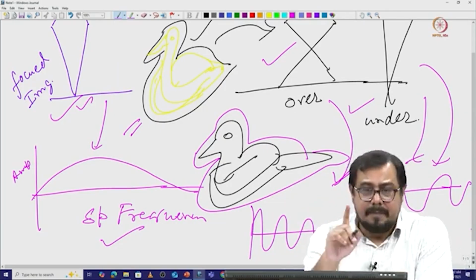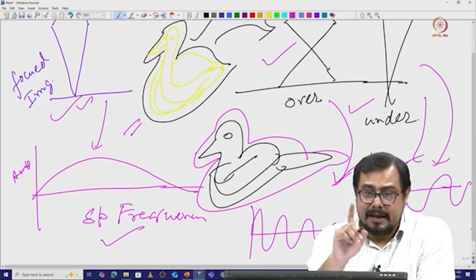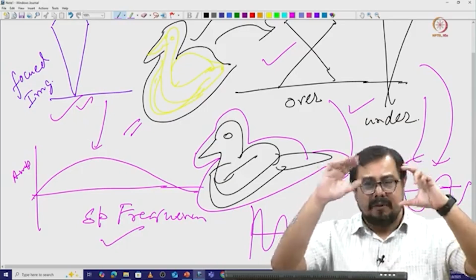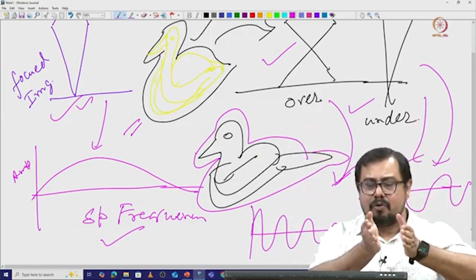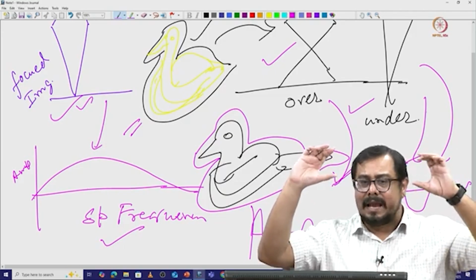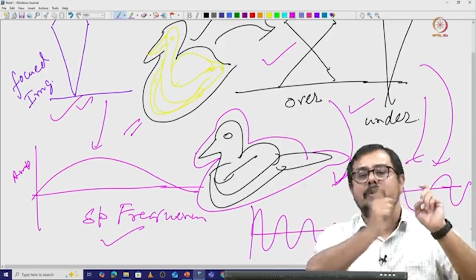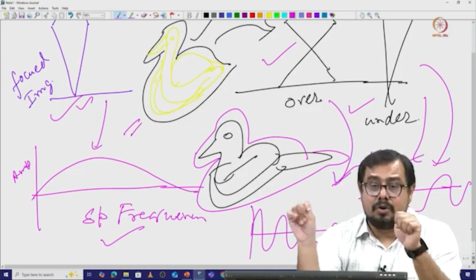One more thing you should remember is that in the last class I also discussed astigmatism. Astigmatism is a very common problem whenever you go to the microscopy room. If there is an unstable lens system, or a little bit of variation in the magnetic field of the lens, the electron beam will be converged in two different planes. If one side of the lens is asymmetric, one side will converge in one plane and the other side will converge in another plane, and then it will give you an elliptical kind of power spectrum. How this power spectrum should look, we are going to discuss.